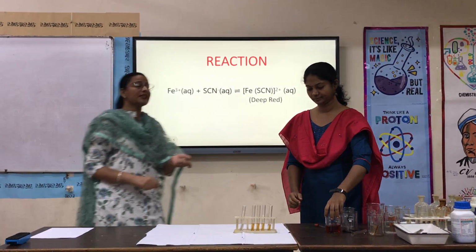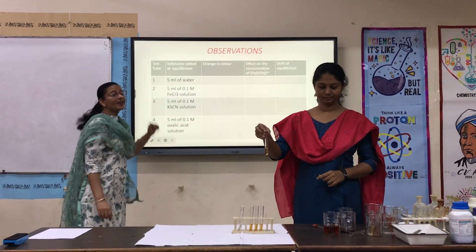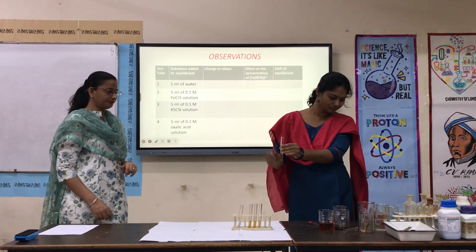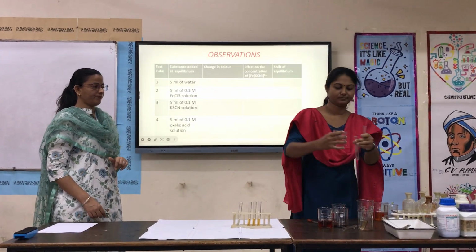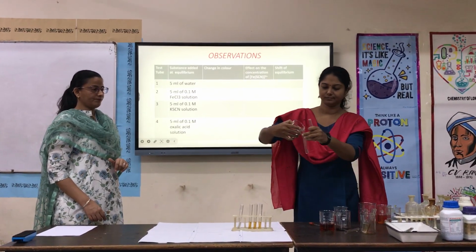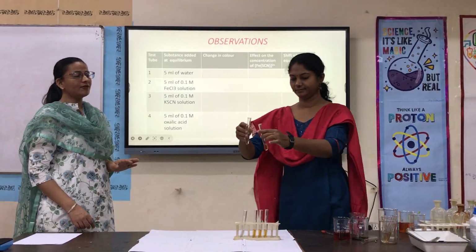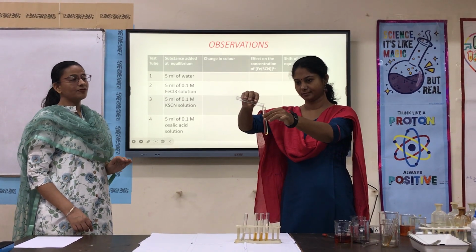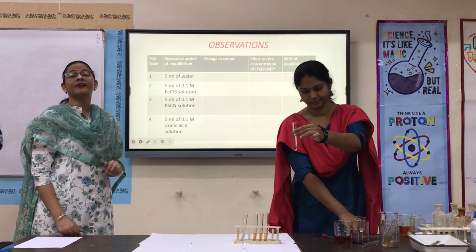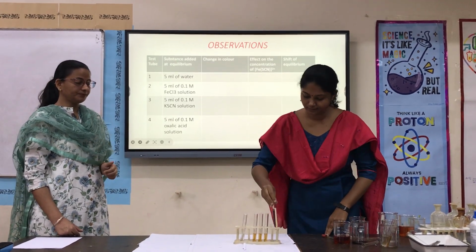So in the first test tube now, we are going to add 5 milliliter of water. So we'll add 5 milliliter of water to it, and we will keep this solution as our reference solution. So this is our reference solution.